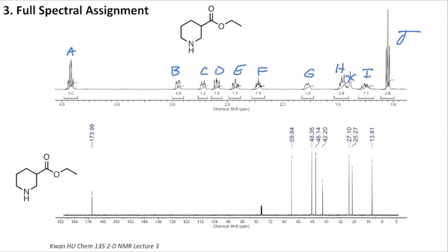The only one that may be a little bit weirder is 2.8. You'll have to round that a little further up to be 3 protons there. Based on these integrations, you may already have some ideas of which protons could belong where. I want to take account of some of these splitting patterns.